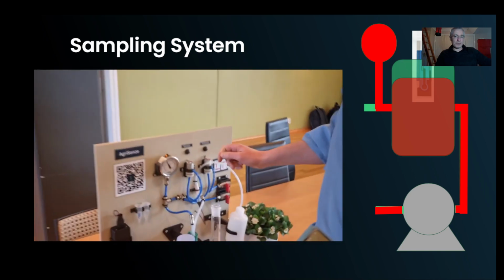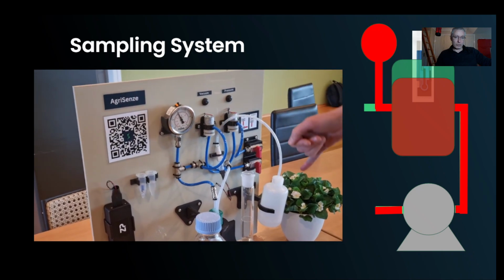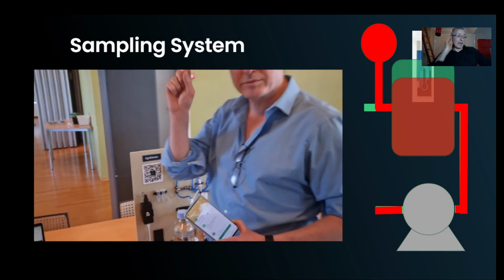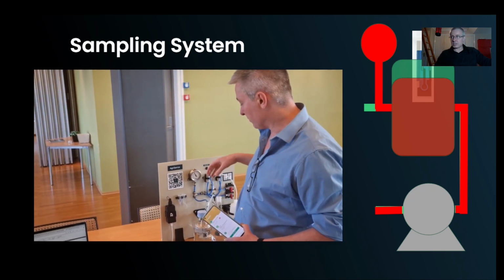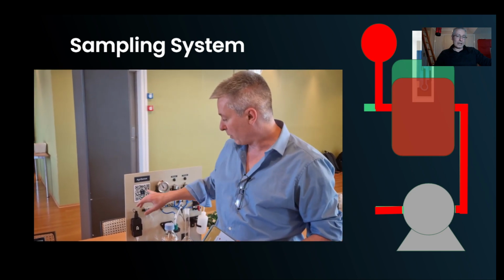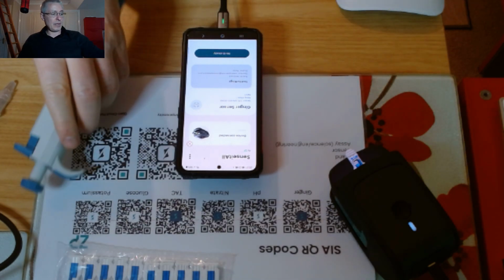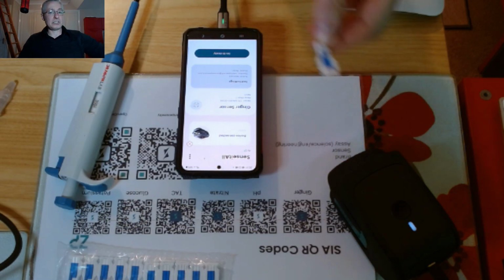Now, question number 5, which is really talking about the runoff of water and measuring the pH of runoff water. I'm going to do this again, but I'll do this in a bit more detail. But just to say that at ZP, we have sensors, but sometimes you actually need to put the sensors into a complete system in order to make use of them. It's easy when you're willing to bring the sample to the sensor. So in this case, I can just bring the sample to the sensor, make a measurement and then essentially get rid of the sensor.